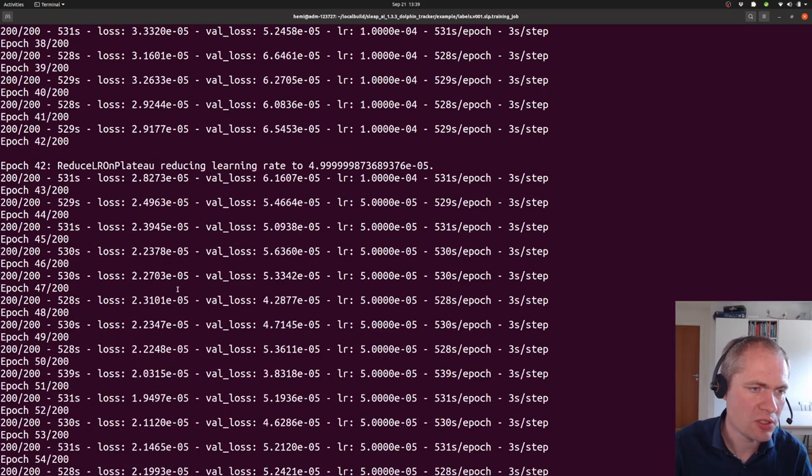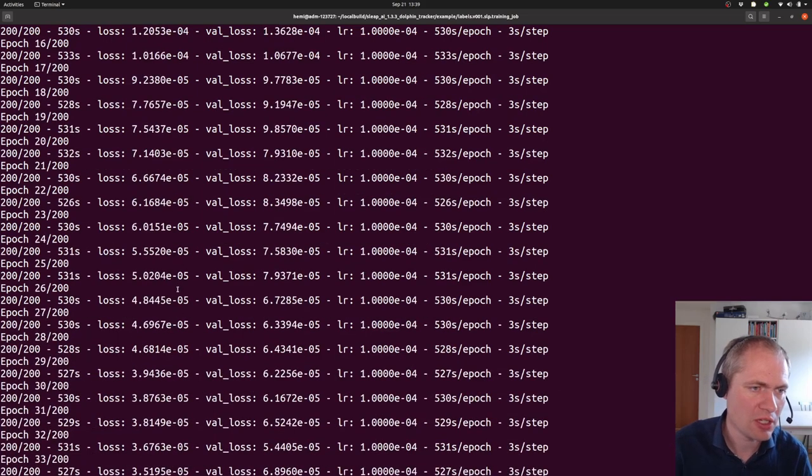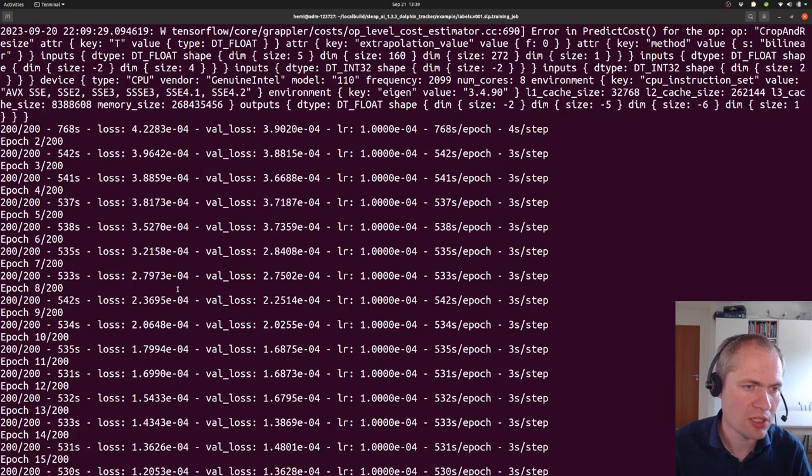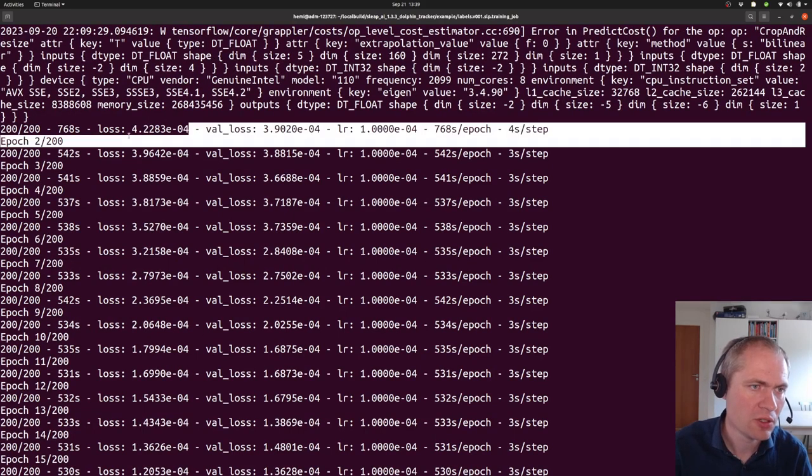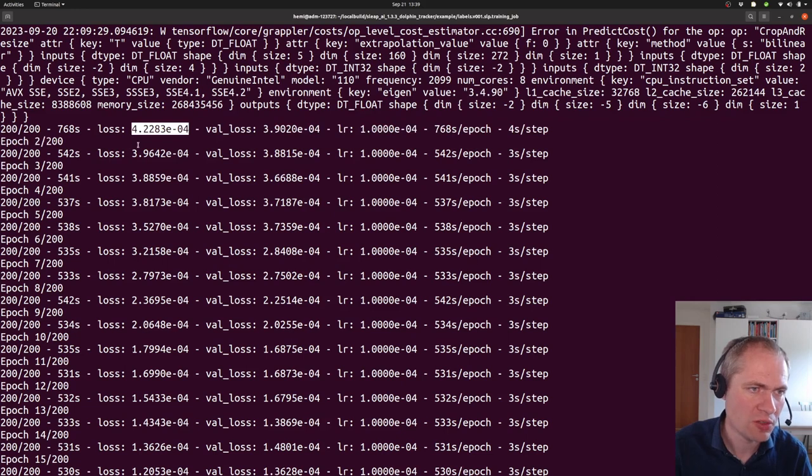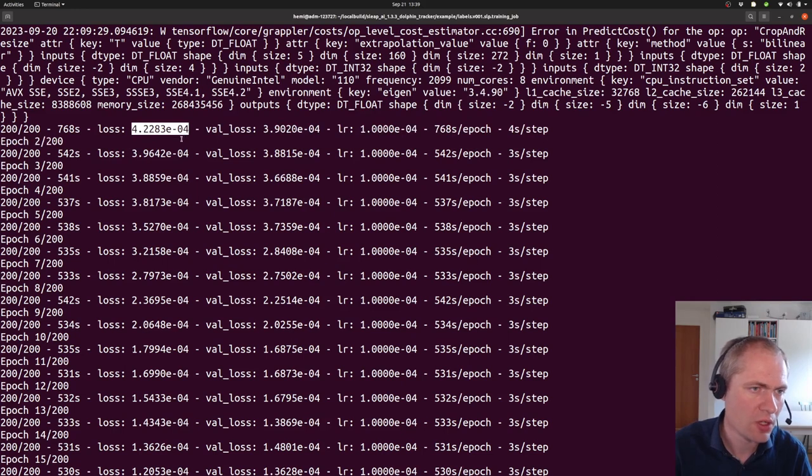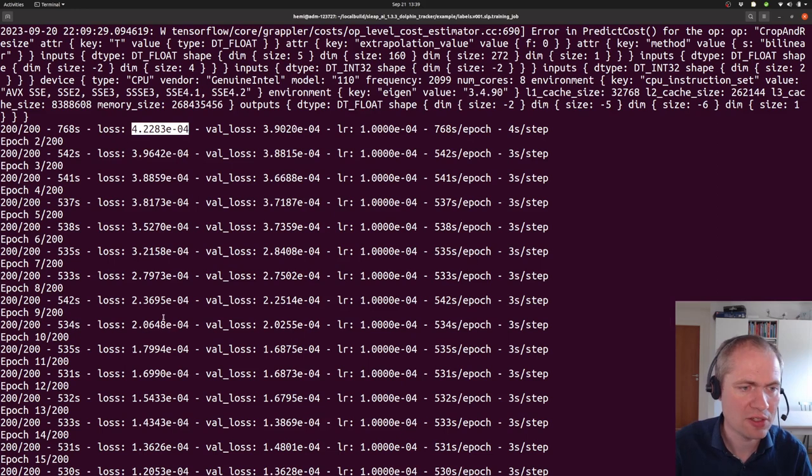And through this period we can see how some measures actually developed over time that indicates the progress of the training. We have the loss function here, which starts out being 4.2 times 10 to the minus 4th. And that value is decreasing. This is a good indicator that learning actually takes place.